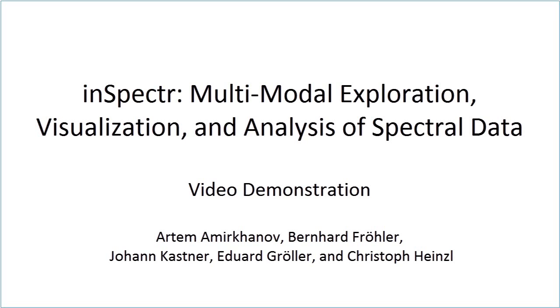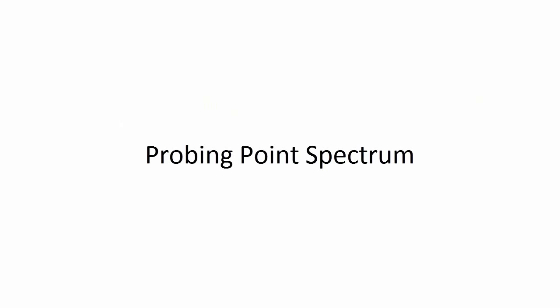InSpectr, a tool for multimodal visualization and analysis of spectral data. InSpectr employs voxel spectrum probing.